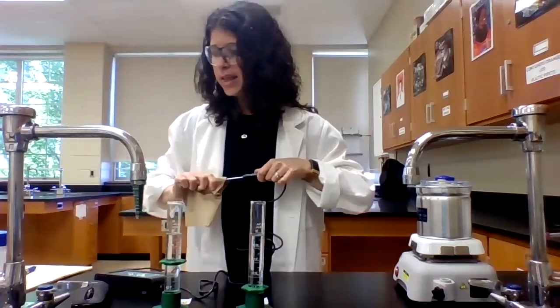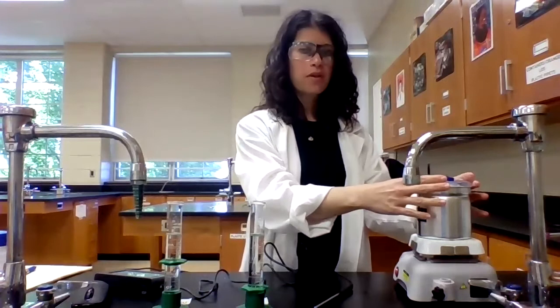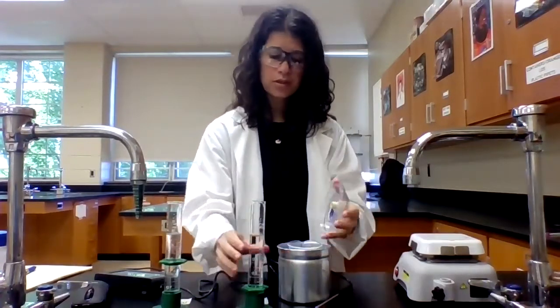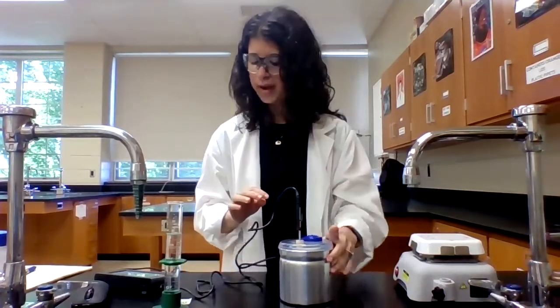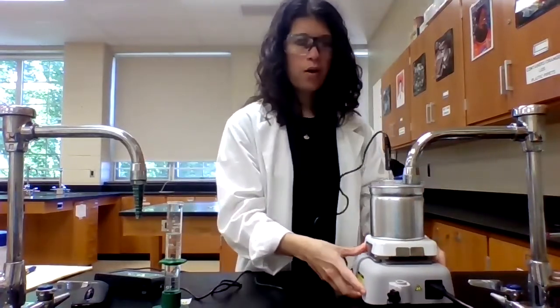Now, I need to get my two reagents into the calorimeter, but I need to move quickly because as soon as they come in contact with each other, they're going to react. And so I need to move quickly so that I can ensure that any heat that is produced from the reaction is contained inside this calorimeter. It doesn't matter which one I add first. I'm just going to pour the hydrochloric acid in here. My stir bar is already inside, and I have my temperature probe ready to go. And so now I'm going to quickly add the sodium hydroxide.